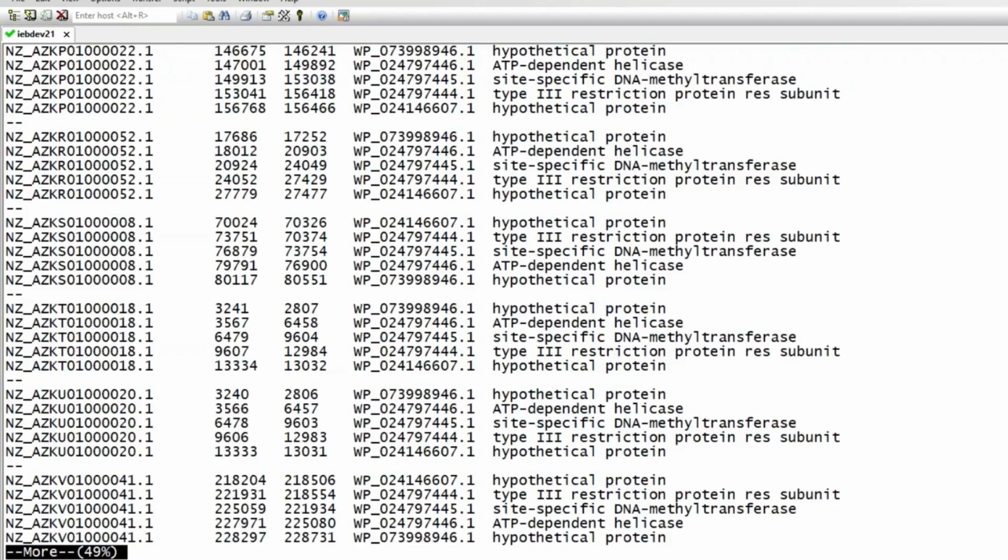Okay, so you can see I've got 2 up, 2 down here. The only real difference you'll notice if you look through is that sometimes they're flipped around because the particular coding region is on the opposite strand, so the order is sometimes different, but the genes are the same. Unlike what we saw a minute ago in the BLAST where they were not the same, in this particular case they are. These are all the Salmonella assemblies that we saw a minute ago.